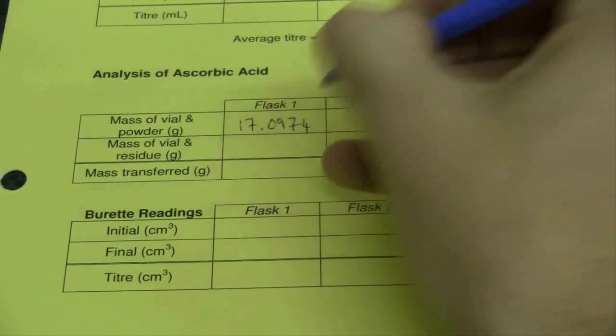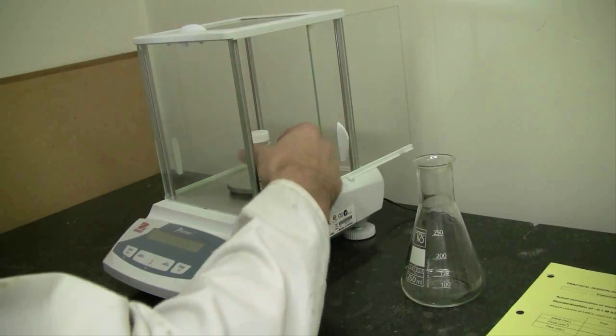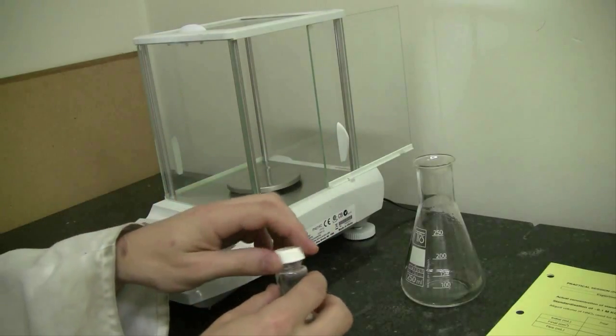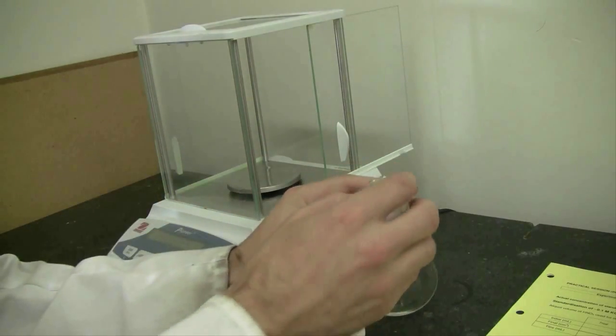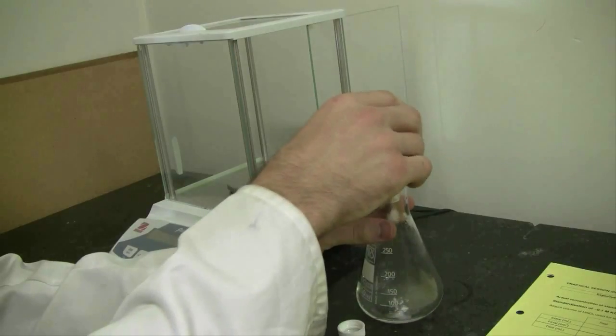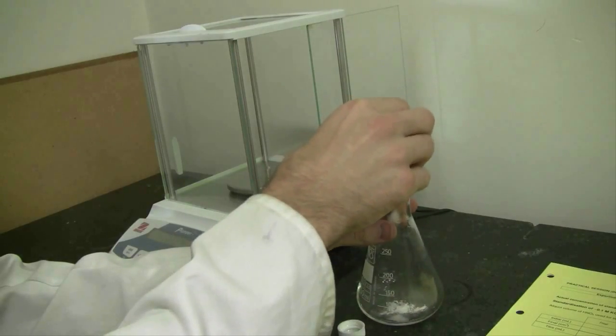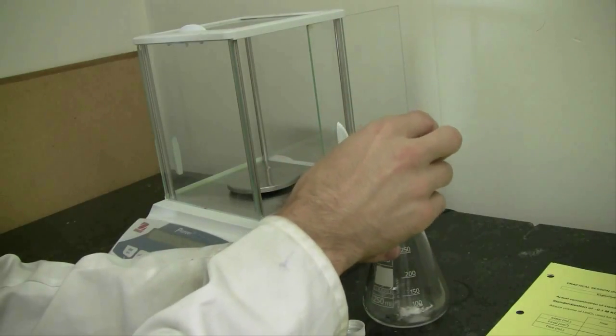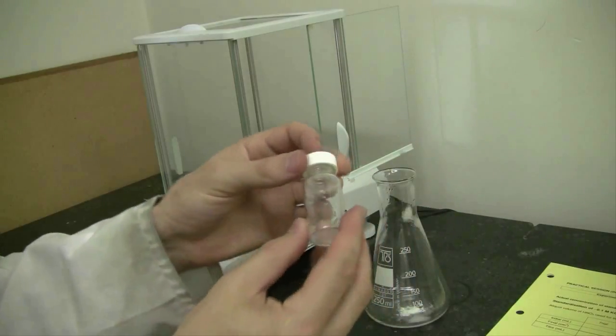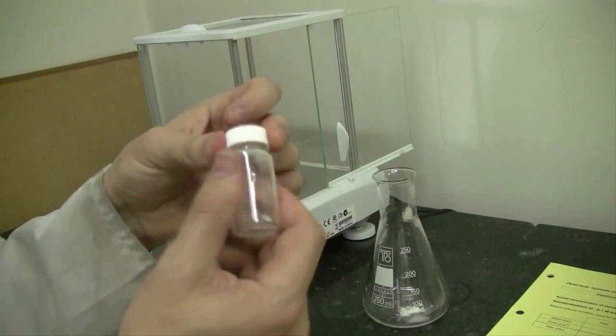Then take your sample out of the balance and carefully pour your sample into your conical flask. It's important to make sure that you don't spill any of your sample outside the flask. Once you're finished pouring, there may be a small amount of residue left in the vial and that's fine - it's not an issue. This technique is measuring the mass that you've delivered by difference.